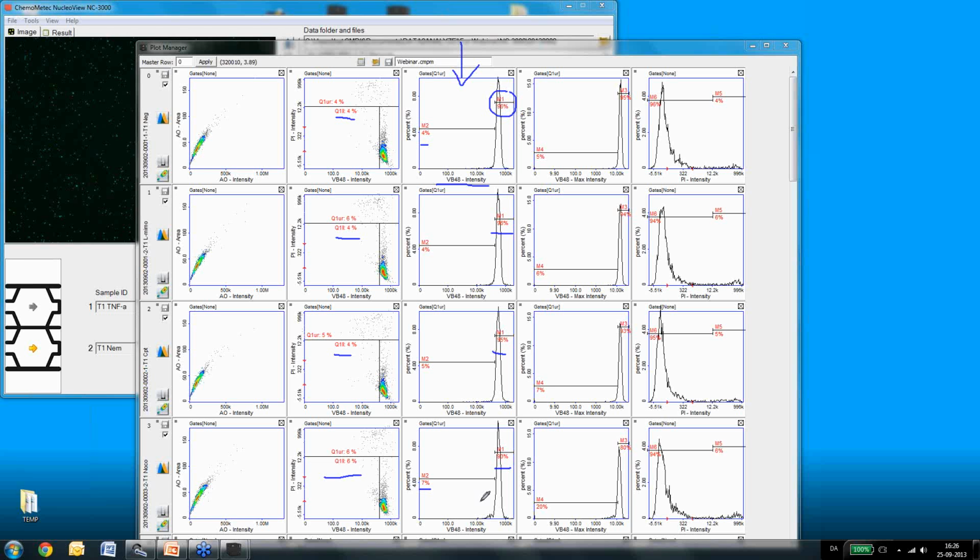However, if instead of looking at the combined intensity for the cell, we look at the most intense spot in the cell, we will see here that again we have 95, 96% of cells being healthy and 5% apoptotic cells, shifting slightly to 6, 7% on some of the treatments. But on the NucleoCounter, you see suddenly it dropped down to 20% being apoptotic in a way where the cell itself hasn't lost its overall intensity. It's not drifted really, but the location of the intensity shifted from a single spot in the cell to a more spread out location in the cell.